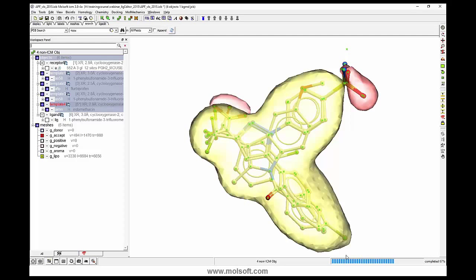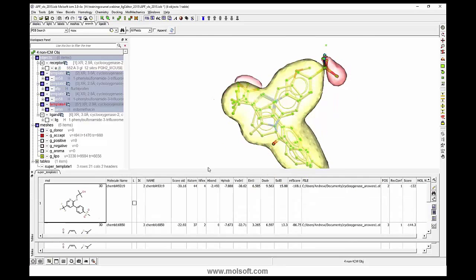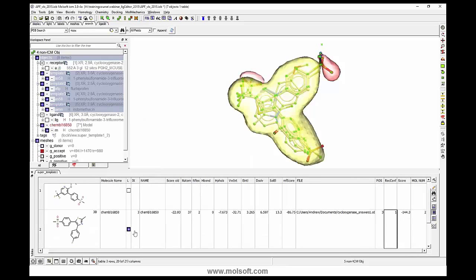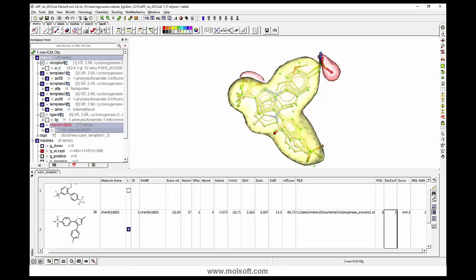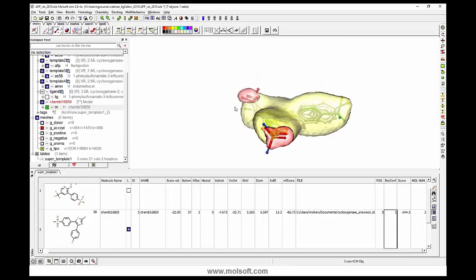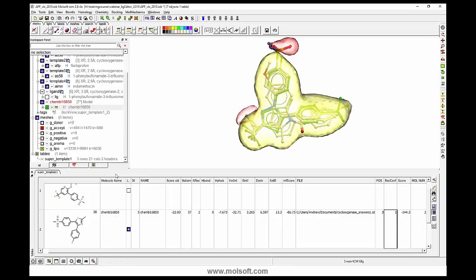And then you screen it in the same way, and we get a hit list again, and we have a score. The lower the score, the better for that. So you can view the docked ligand in the fields. So the yellow here represents lipophilicity, and the red are 2 hydrogen bond acceptors in these 2 positions here in 3D space. So ideally, if your ligand has a very good match score, it's likely that your docked ligand will match that pretty well.